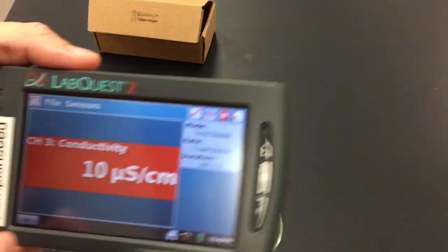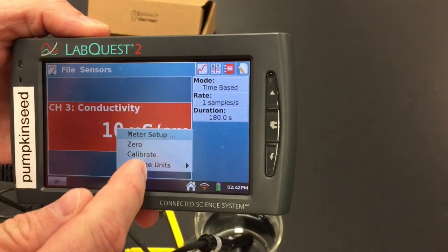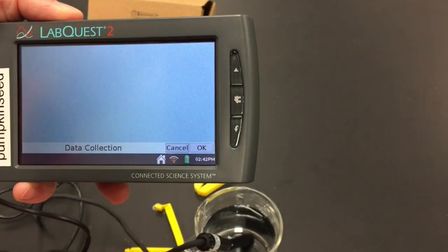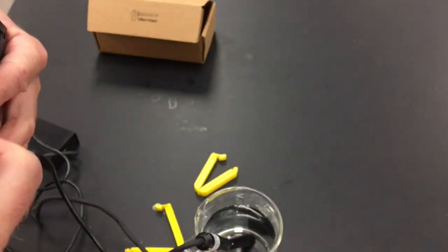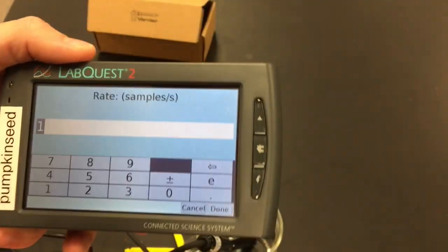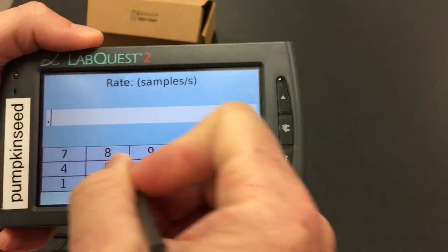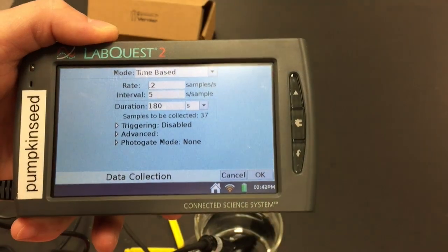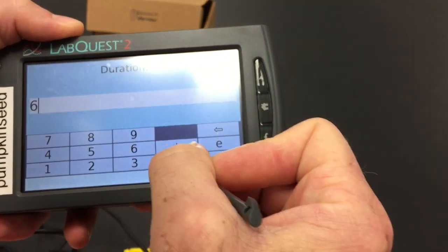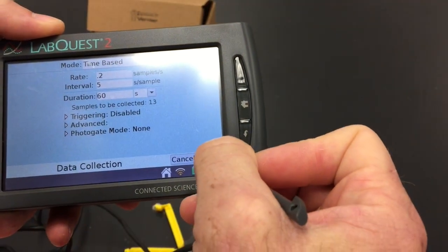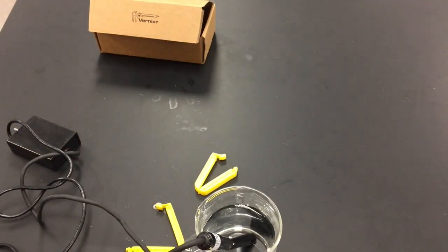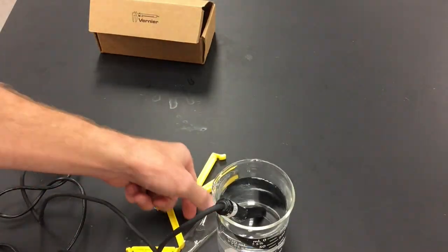I'm going to change the units to milligrams per liter. I'll also change the collection parameters. There's a stylus inside the Lab Quest if you want to use that instead. I'm going to change the rate to 0.2, leave the interval, and change the duration to 60. The Lab Quest is all set up, conductivity meter is in the purified water, and now I've got to get the dialysis tubing set.